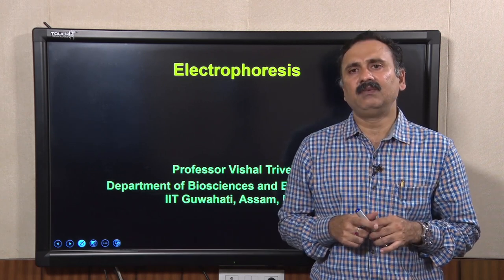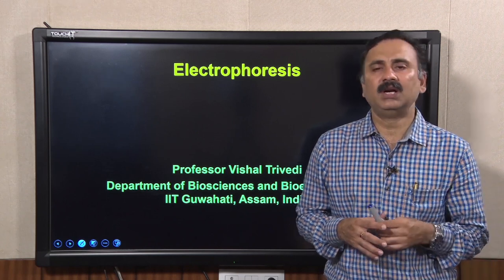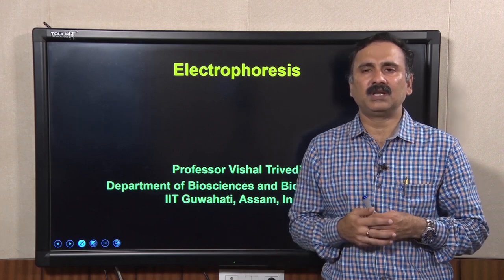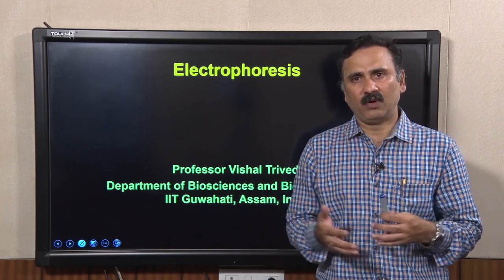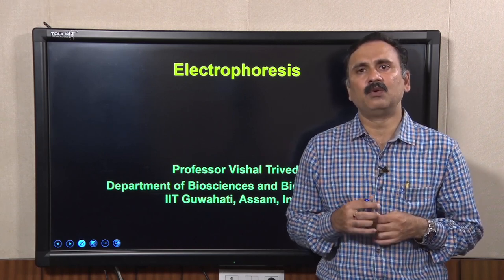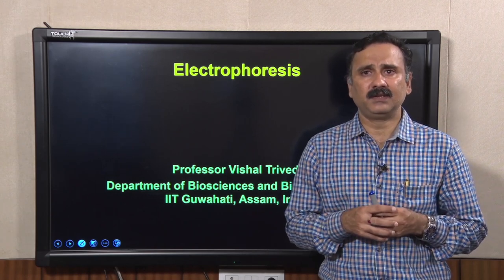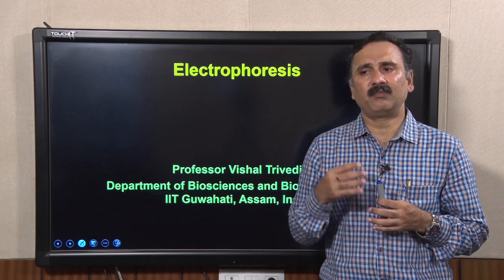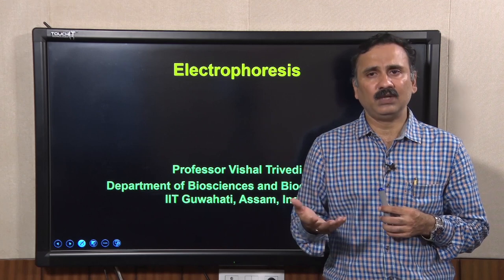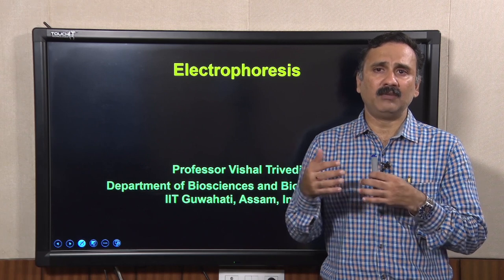And what we were discussing was horizontal gel electrophoresis in our previous lecture. We have discussed the experimental conditions and how to perform gel electrophoresis. We have also shown you small demo clips of how to do it in the lab. I hope these two things have explained horizontal gel electrophoresis in more detail, and you will be able to perform agarose gel electrophoresis in your own laboratory.